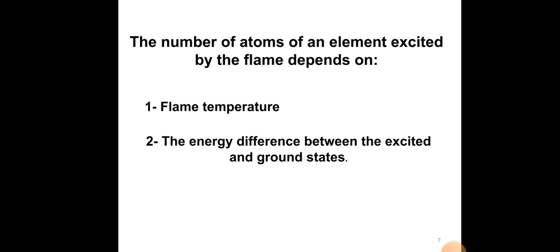For example, alkaline elements can be excited very easily with a lower temperature, but some elements require more energy.